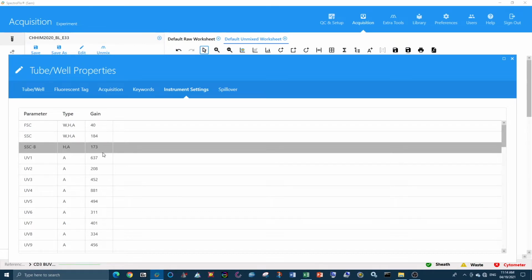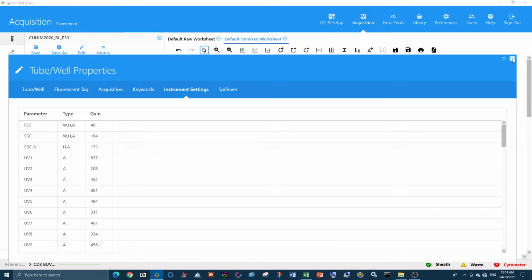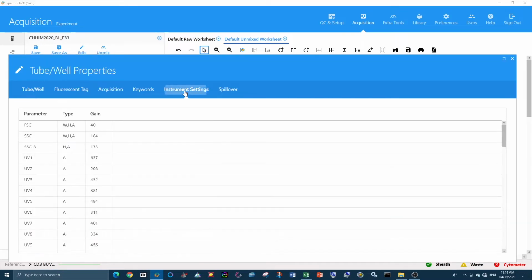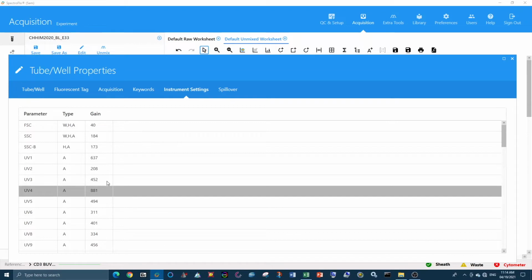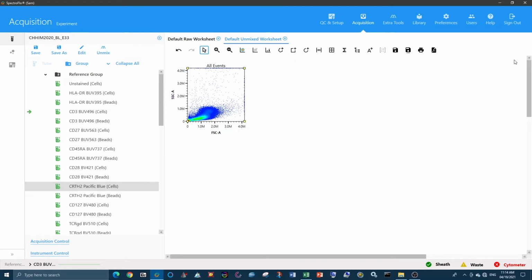Now that we've verified the Cytek assay settings we used here, we just want to double check that all the tubes in the experiment were recorded under the same settings. So again, just remembering those top few numbers, if I come down to another tube, I should see those same numbers, which I do, so that's great. I'm confident that everything has been acquired at the correct settings, everything is able to be gated on and clean, so we can move forward with this data.